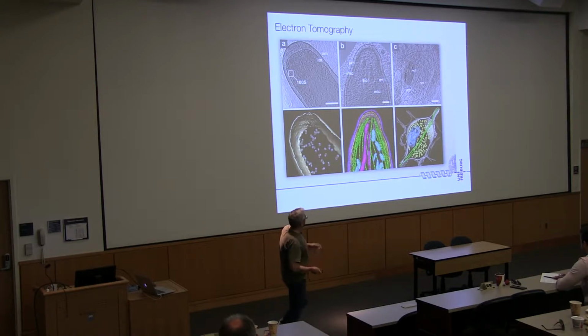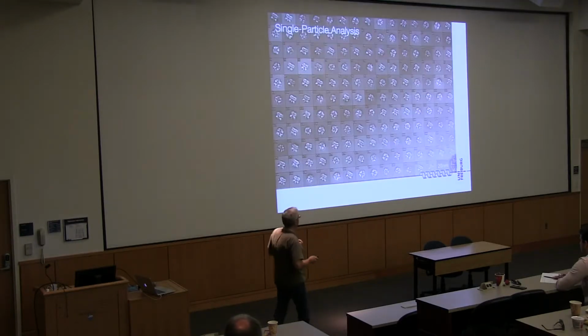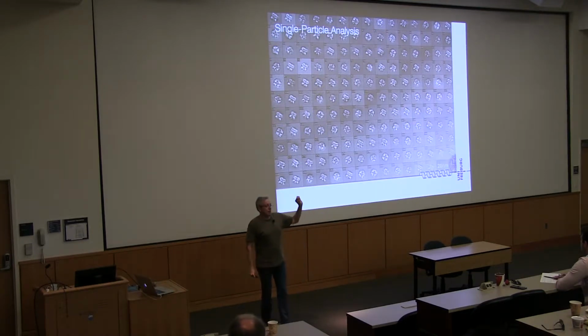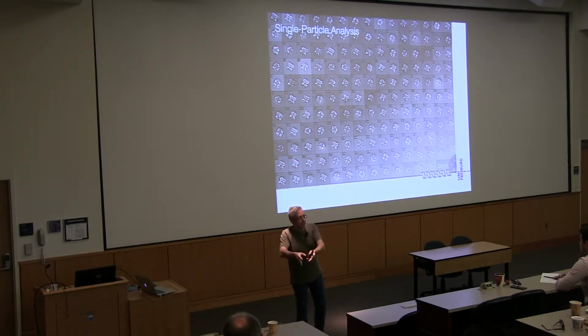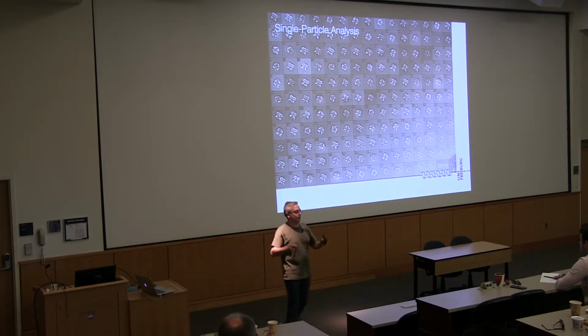So the other side of cryo-electron microscopy would be, how do you get to resolutions that are as high as possible? And the trick to that, that's where it becomes relevant for crystallography, and that's why I'm talking about that, is this. That's what's called single particle analysis. So the problem is, if you have an electron microscope, then you usually have something like 300,000 volts on that, and an electron beam with 300,000 volts hitting a single protein molecule is a bit this whole like Death Star versus X-Wing situation.